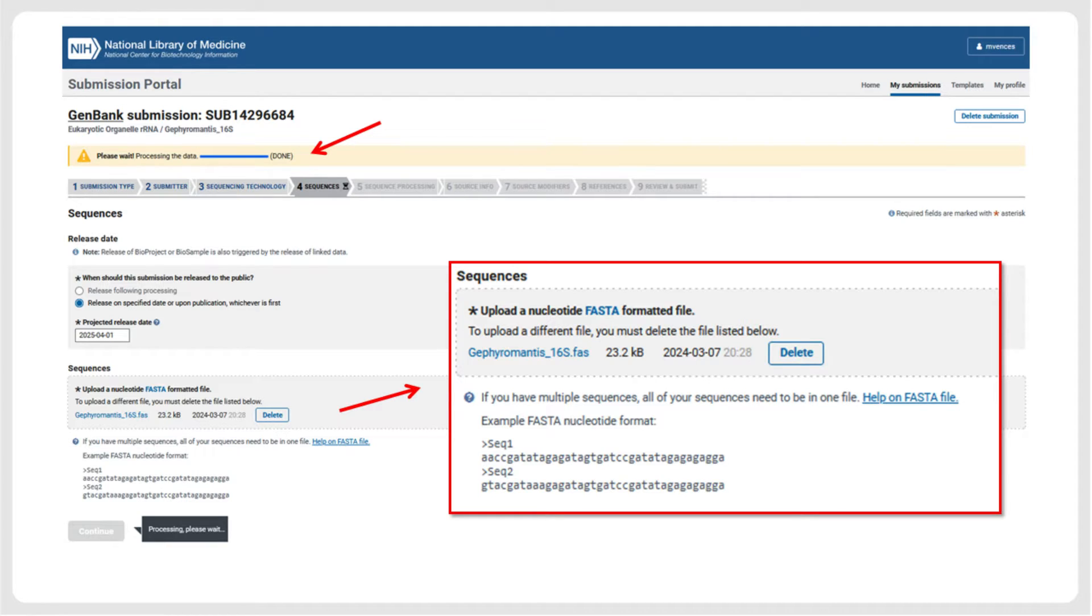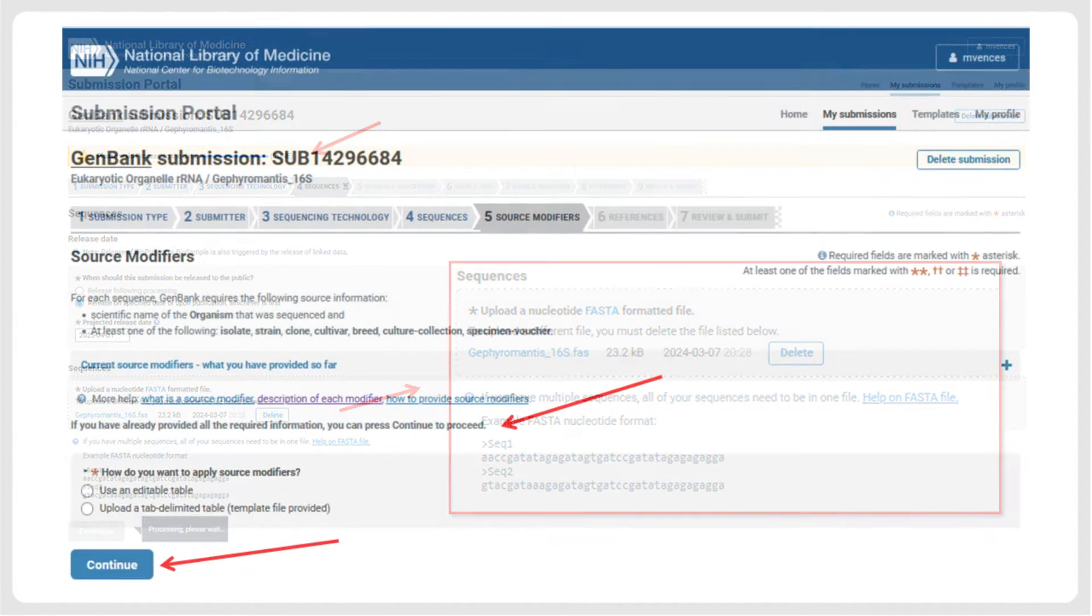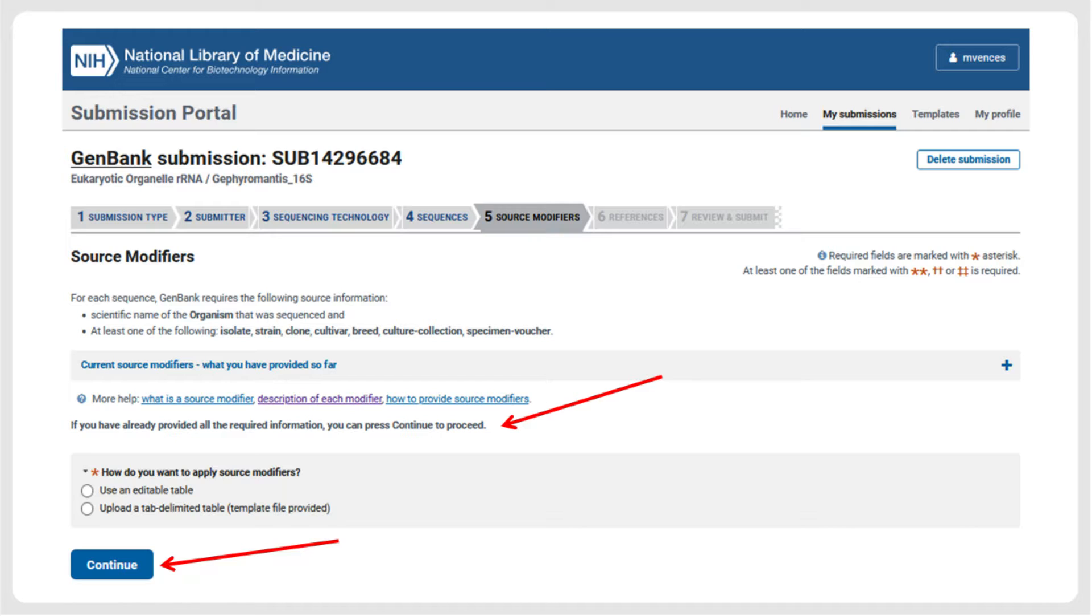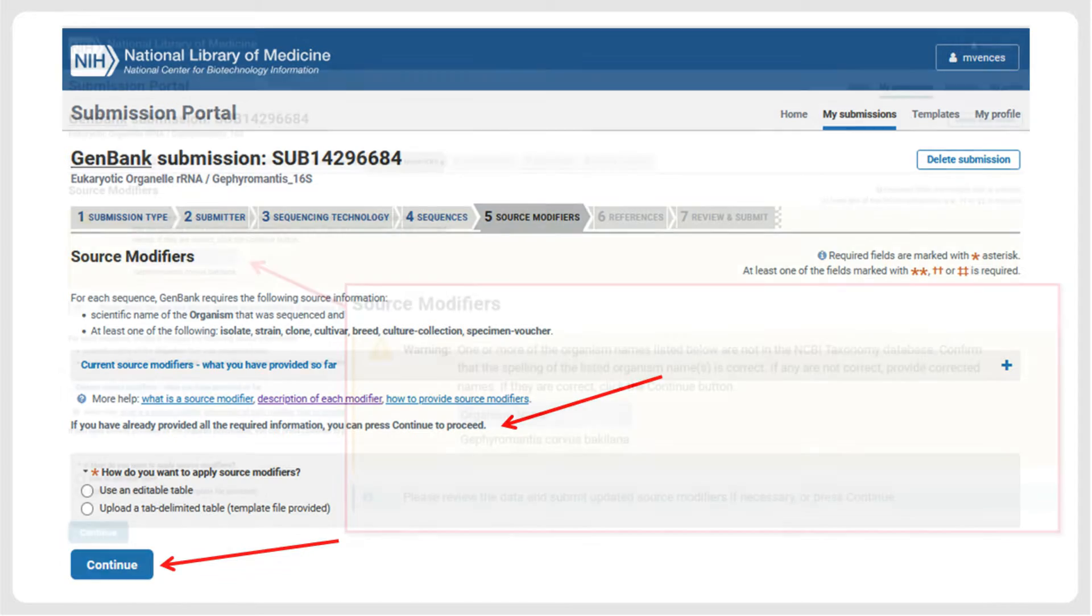After pressing the Continue button, the uploaded sequences and metadata undergo automatic quality control. In the next step, source modifiers can be specified or uploaded as a separate table. In our case, we can simply press the Continue button because we have already included the source modifier information in the FASTA file.